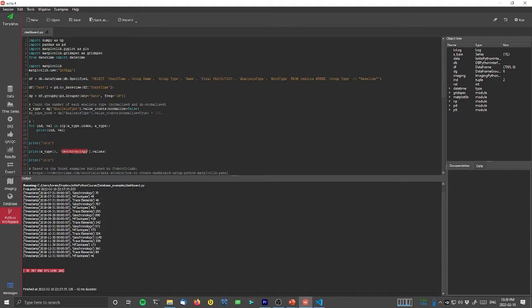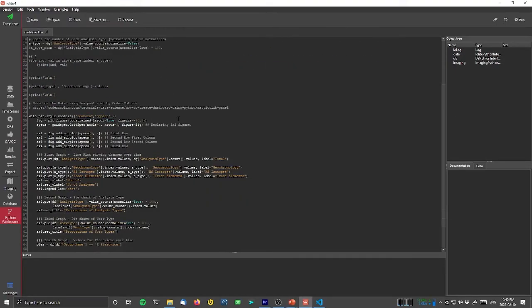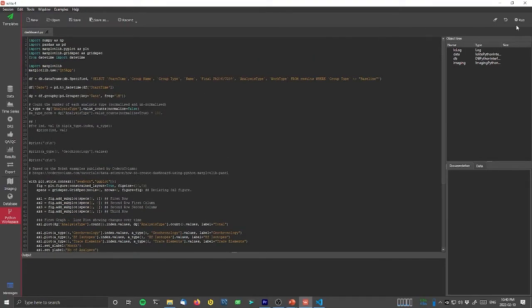And we can just switch this index here around to be hafnium isotopes and trace elements to get the values we want to plot in our graph. So now that we've done that, let's look at the rest of the code. I'll actually just run the code through just so you can see what the output looks like, and then I'll explain how it was put together.